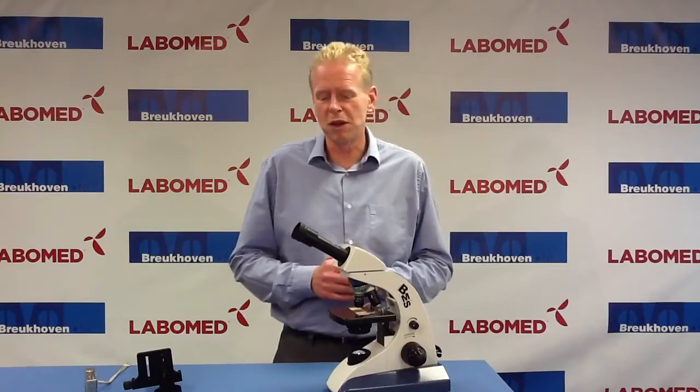What you need is of course our Universal DigiTube adapter. A camera — in this case I'm using a Canon XS. And of course you need to have a good microscope. I would prefer and advise you to take a BMS version because then you are secure that it's a good quality.